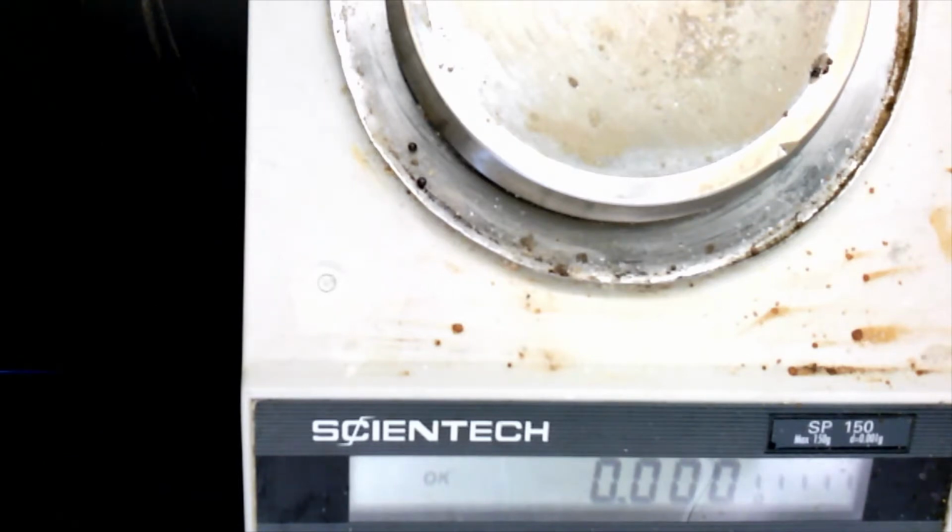So I'm just taking a little piece of sandpaper and trying to get all of that tarnished surface off so that I get a nice shiny strip of magnesium underneath. Okay, that ought to be good enough.